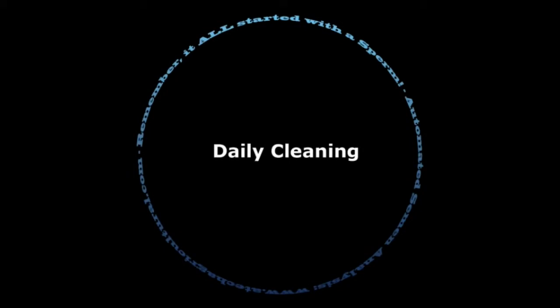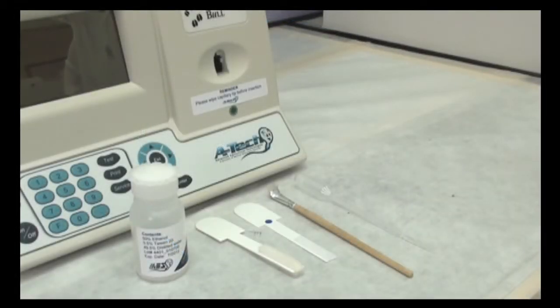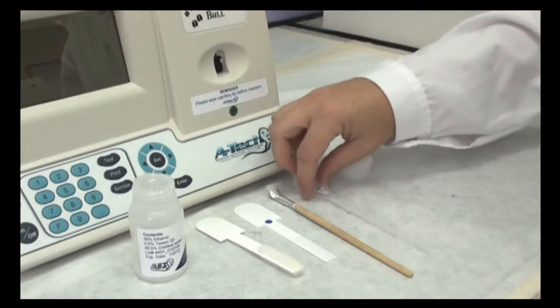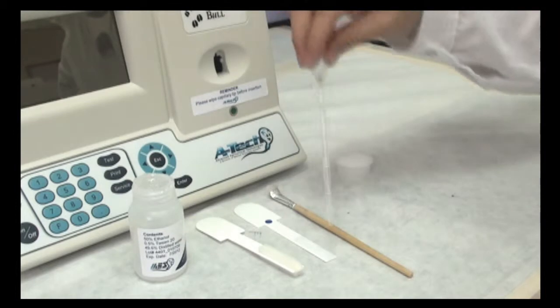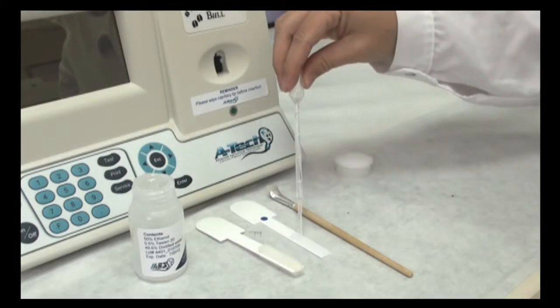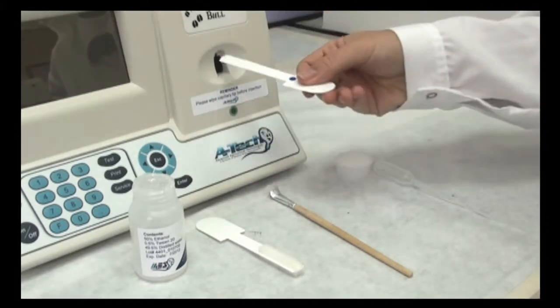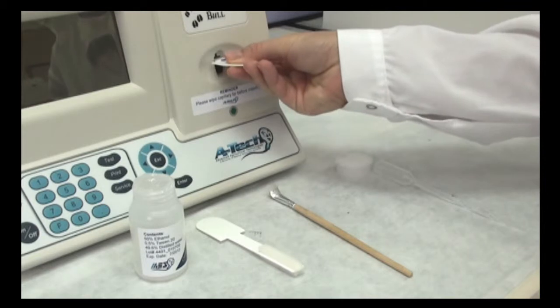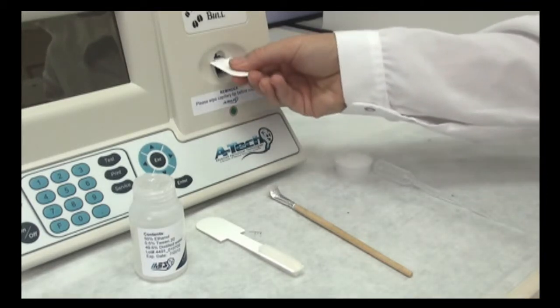At the end of any day you run semen samples on the machine, it needs to be cleaned. To do so, open your cleaning solution and apply a few drops to the blue dot fibrous cleaning capillary. A standard transfer pipette makes this part of the process simple. Then, insert the cleaning capillary into the instrument as you would a standard testing capillary. Give it a few thorough strokes reaching all the way in, then flip the cleaning capillary and repeat.